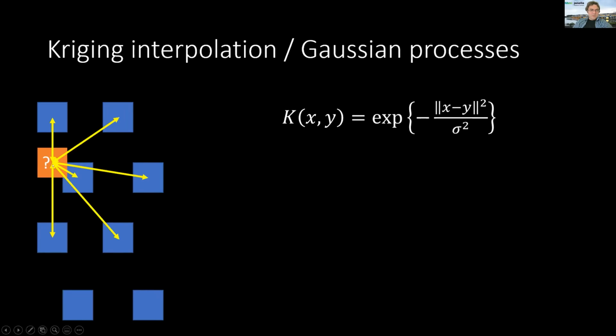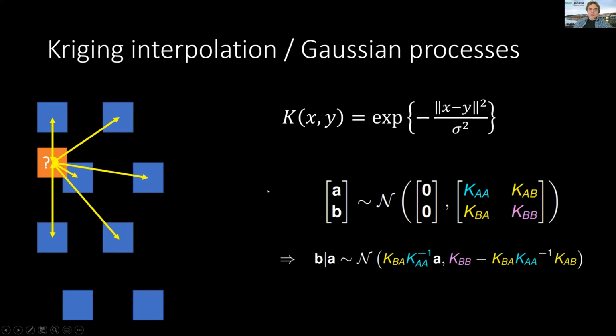If it decays smoothly, then it should have, on average, a certain correlation with these sites based on the distance. And that allows us to invert the problem as standard kriging to predict what the voltage would be here, just based on that smoothness assumption, which is what interpolation is. It's taking advantage of smoothness to determine the value at an unobserved position.